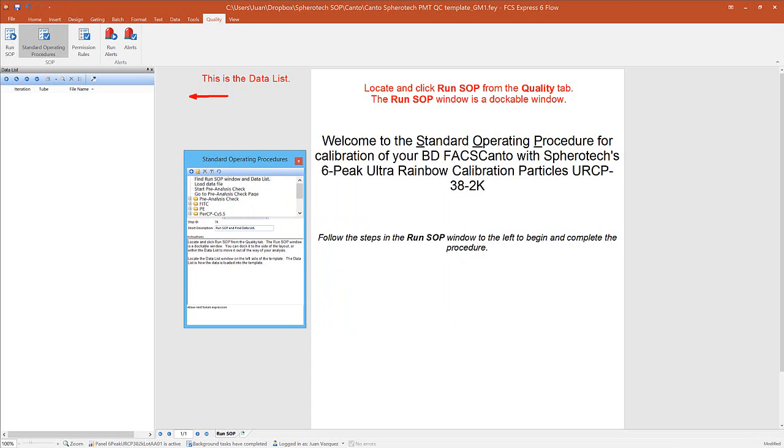And then what we can also do is provide conditions that would allow the user to proceed to the next step. Here I don't have one, so when I decide to run this, I'll just be able to freely go on to the next step without having to worry about any conditions that need to be met. But what we can do is provide conditions where maybe I don't want to go on to the next step if it turns out I don't really have any data in my data list.